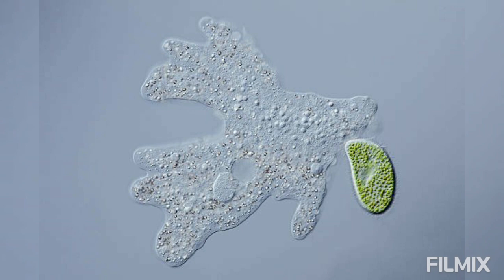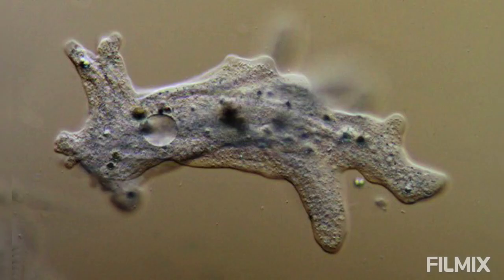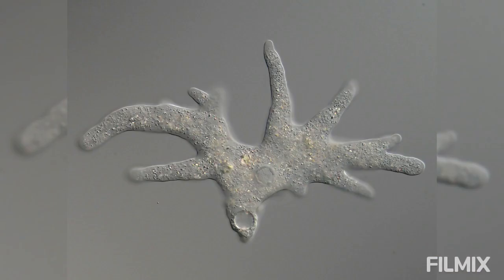To this filtrate, a few amoeba-rich water drops are added and the amoeba are allowed to multiply for 2 or 3 days.